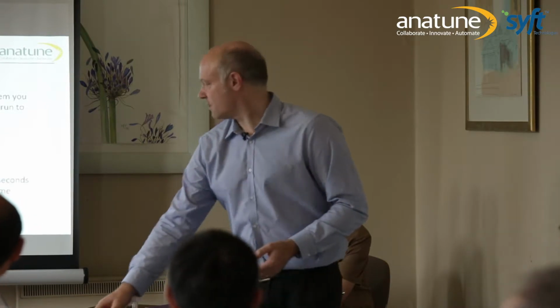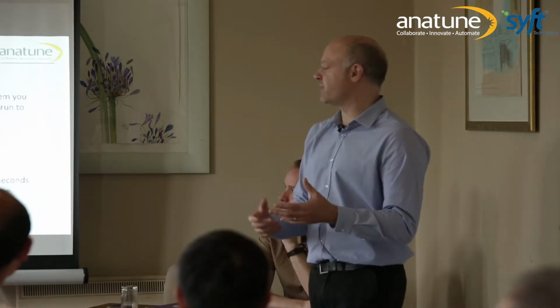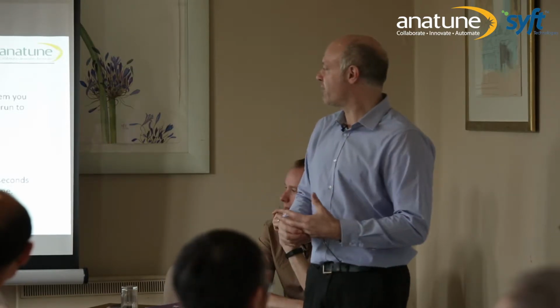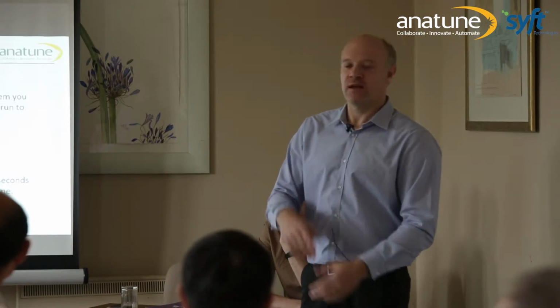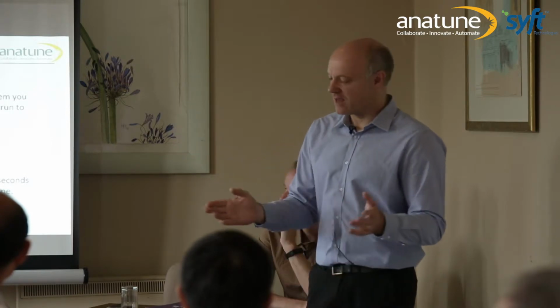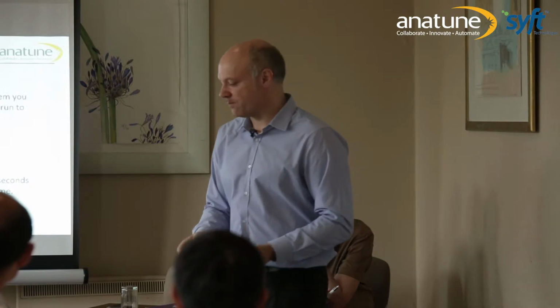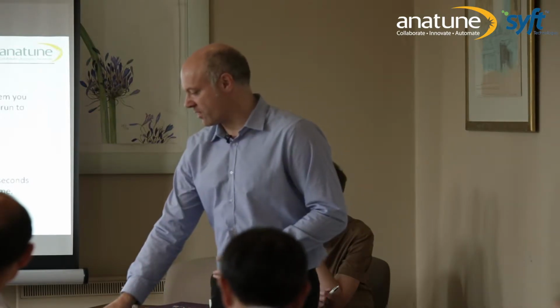With the SIFT-MS, if you get a sample into your system and you've done it wrong, you've got the wrong concentration, you've made it the wrong way, pretty much you can stop the method there and then. The whole thing clears through the system. Any carryover, it's gone within less than a minute, and you can start again. So you can see how the method development cycle is much quicker with SIFT-MS versus GC-MS, which means that hopefully that translates into much quicker method validation as well. So the first part of the talk is going to be on some work that wasn't done by us.